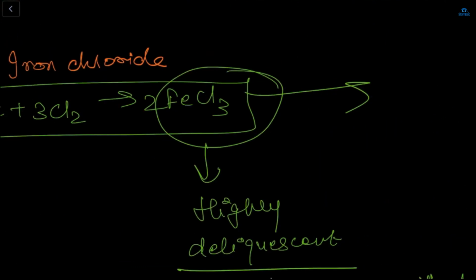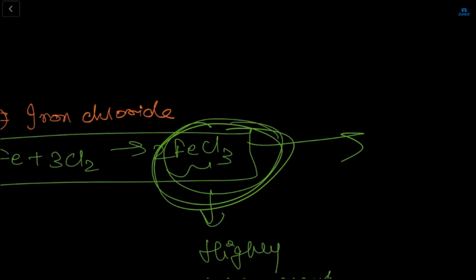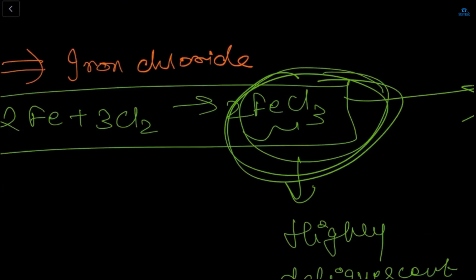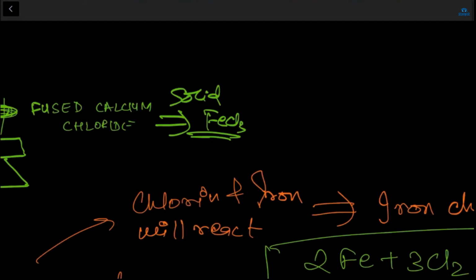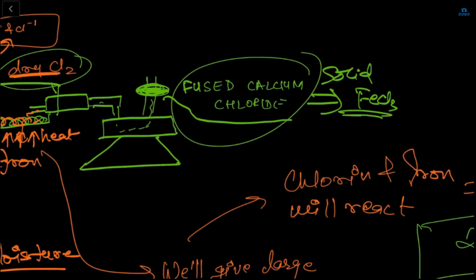And again, this FeCl3 is also not fully anhydrous. Some small amount of moisture is present in this FeCl3 after all these reactions. Then we will again pass this FeCl3 through this tube. In this tube there is fused calcium chloride. What is the use of this fused calcium chloride? It will absorb all the moisture which is present. So after absorbing all the moisture, we'll get a solid iron chloride.